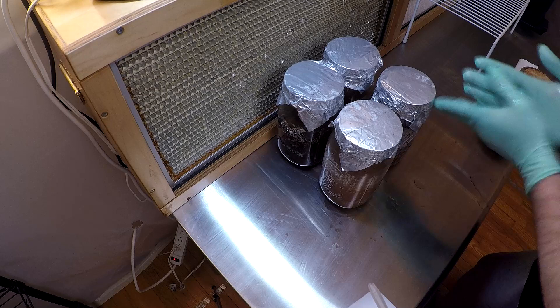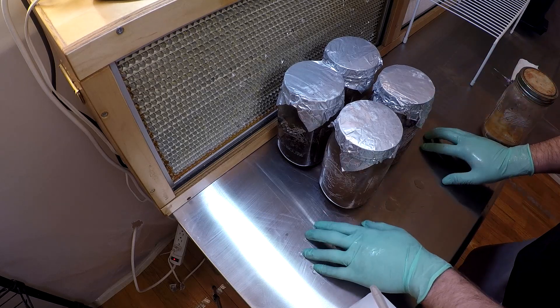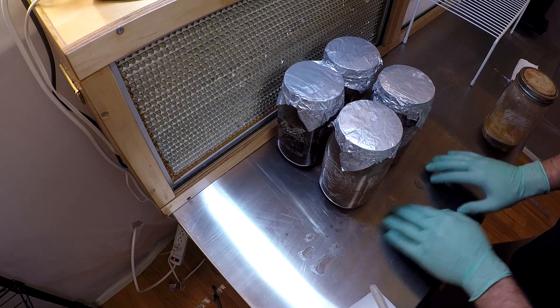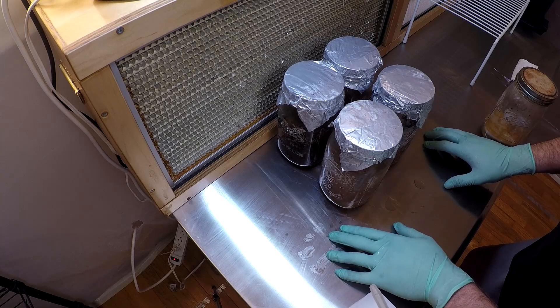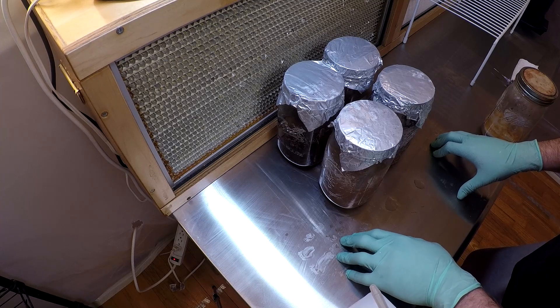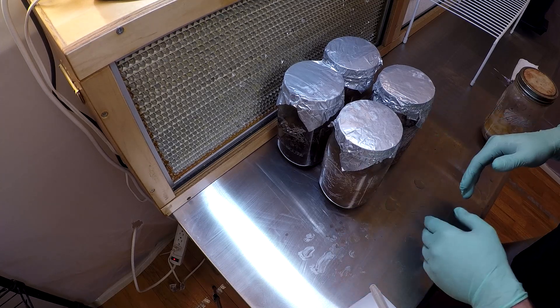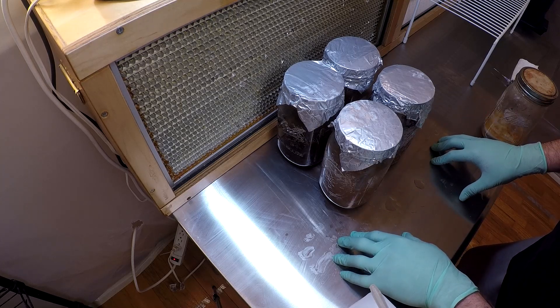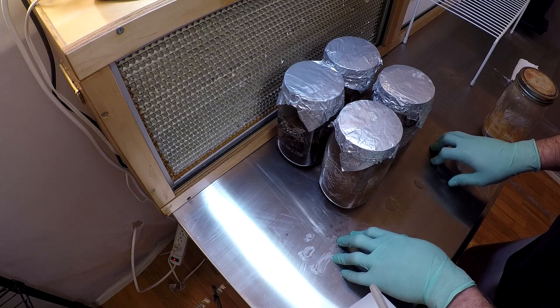One of the things I've changed in this room is that this table now is a stainless steel table, and I'm not using the panel of glass anymore because this is not a good surface to work off of. It is higher, so I'll have to get a chair that's a bit higher if I want to do sit-down work. But for the most part, most of the work I do in here I stand up anyhow, especially when I inoculate bags of grain or bags of salt.